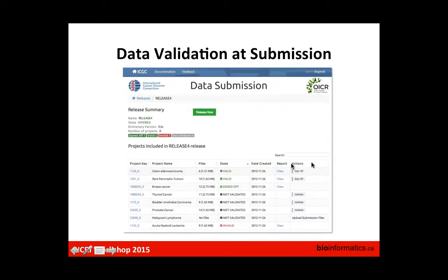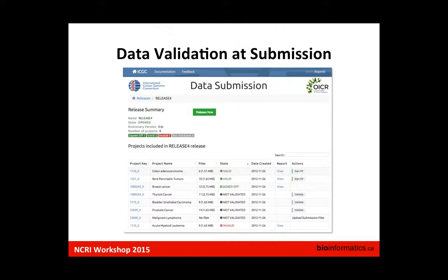This screenshot shows the submission system open to submitters. We have a status showing how many files are valid or invalid. The submitter gets a report, then they can correct the errors and sign off.